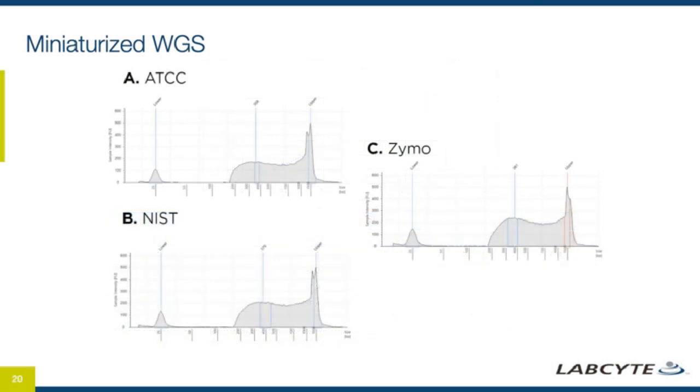Moving on, I'm just showing some electropherograms here from the Agilent TapeStation that we use in-house. You'll see that all 3 samples produced very similar fragment size profiles, and so I was confident to go ahead and assume they were all similar in my normalization calculations. You'll see that there's a long right tail, which is also nice for our chosen run length, which is 2 by 300s on the MiSeq. We're using a V3 kit that's capable of 600 cycles total. So 2 by 300 gives us nice big reads for these genomic assemblies.